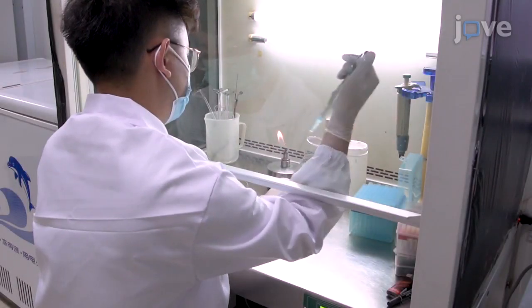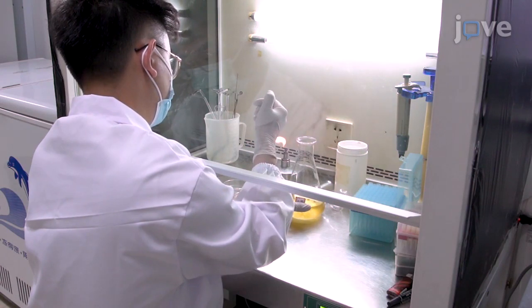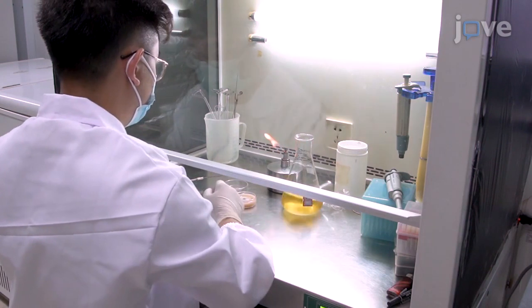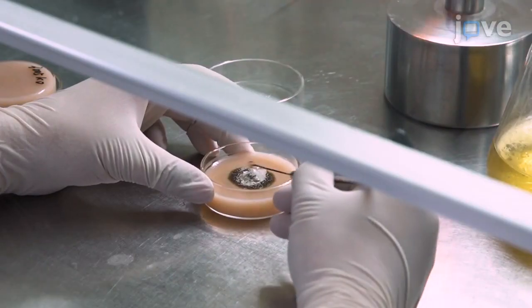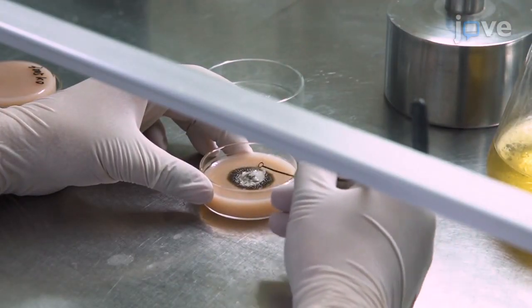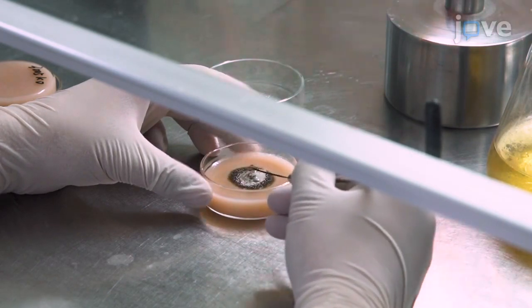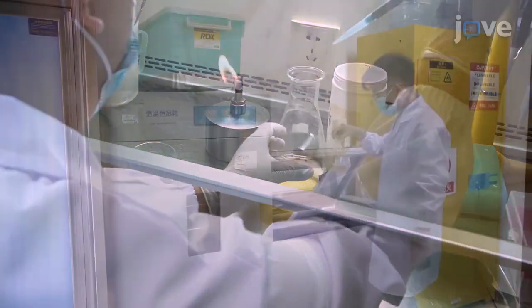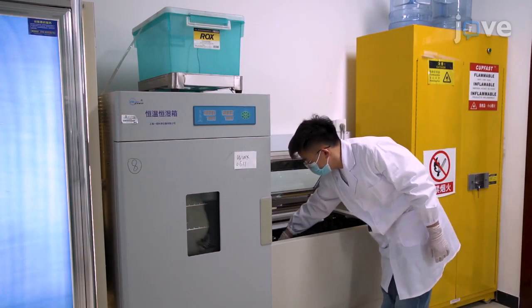Begin by adding 100 microliters of liquid complete medium to the oatmeal tomato agar plates using a 100 microliter pipette. Using an inoculation loop, scrape the mycelia of the wild-type strain and the knockout strain. Collect the mycelia debris and transfer them to 250 milliliters of liquid complete medium.